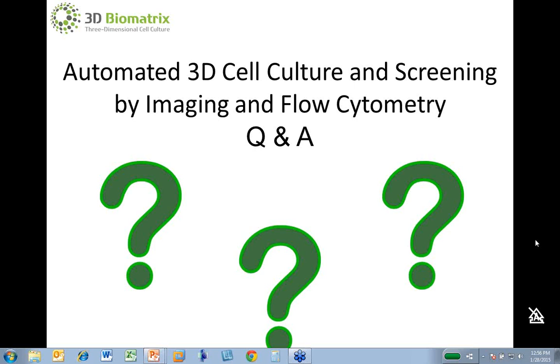So again, I basically determined what worked empirically, and I do think that's going to vary depending on the cell type you're using and some of the other factors that I mentioned. What we used was a fairly straightforward approach: Accumax is a pretty robust enzyme solution, and how long we incubated or pipetted up and down was determined empirically. I'm happy to share that information.